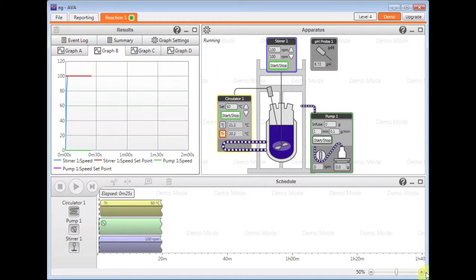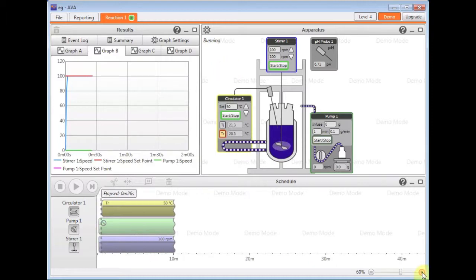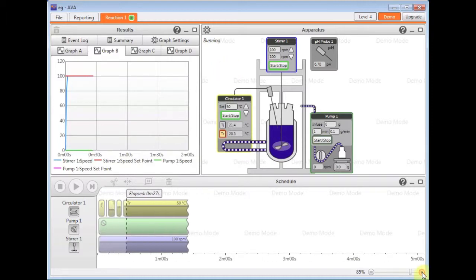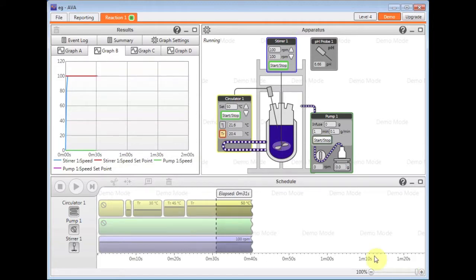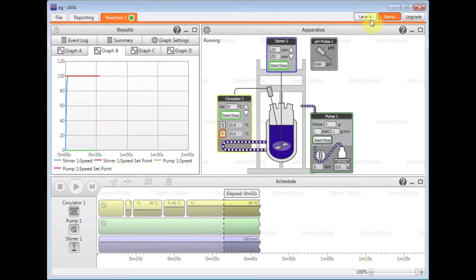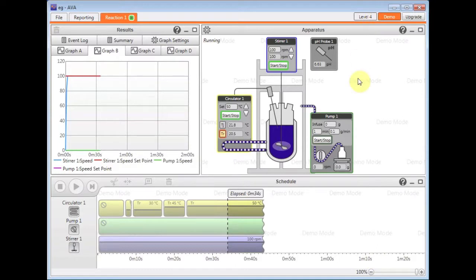If I zoom in to the bottom here on the schedule, you can see the steps that I've created or have been created for me from the apparatus based upon the actions that I've just done.